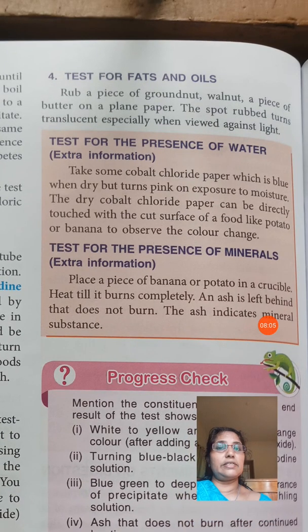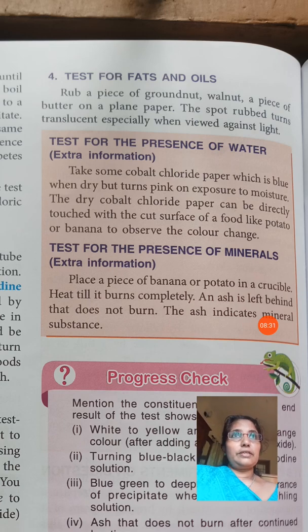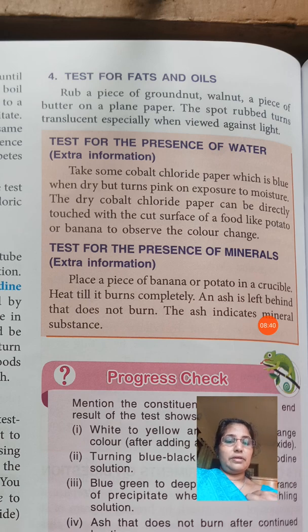Then what is the test for fat and oil? Rub a piece of food particle over a plain paper or a butter paper. We can see the spot rubbed turn translucent. Translucent means especially when viewed against the light. If we apply oil on plain paper, that paper turns translucent. In that way we can understand that the particle contains fat.